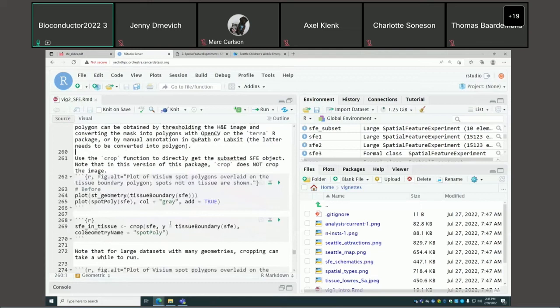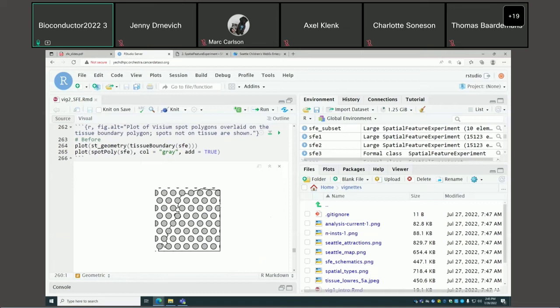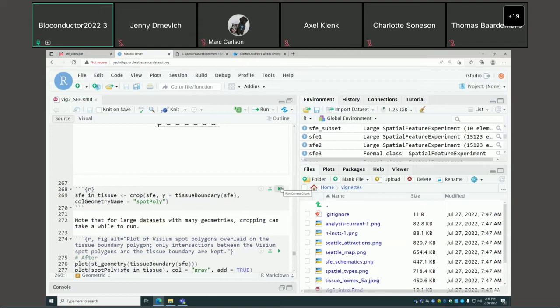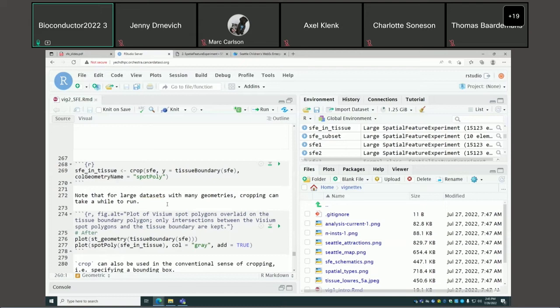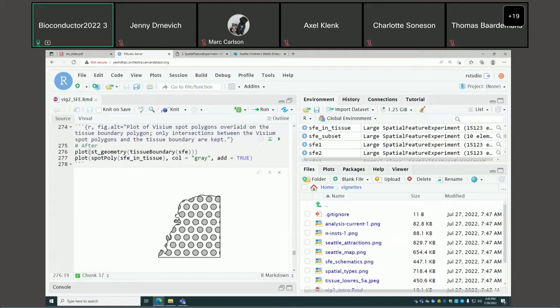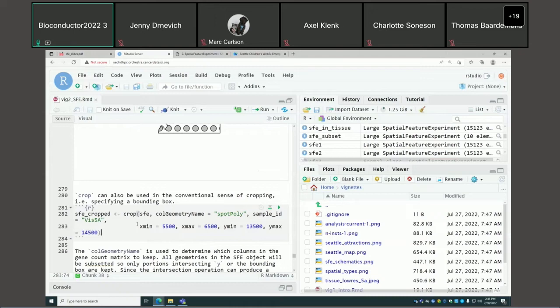Because we have spatial information, we can also perform geometric operations on the SFE object. Here we're plotting Visium spot polygons in front of the tissue boundary polygon, and we want to subset this SFE object to keep only spots on tissue. There's a crop function — you can use a geometry to subset an SFE object.